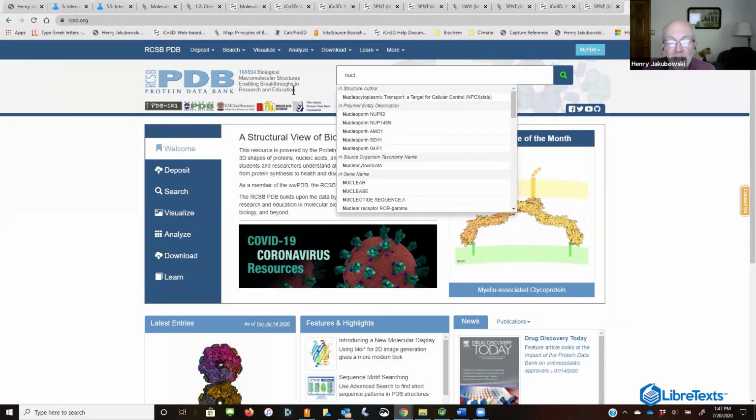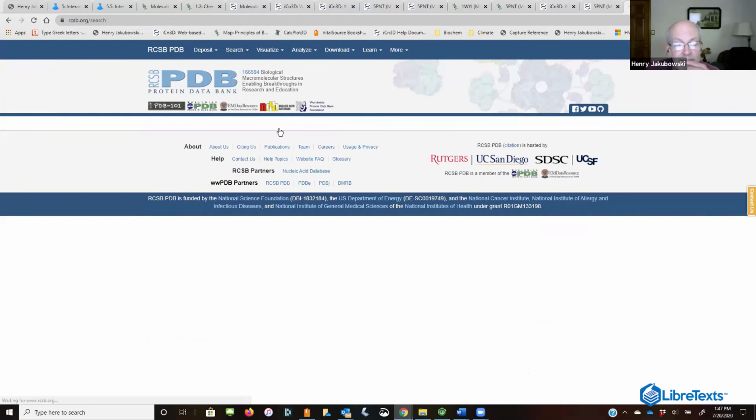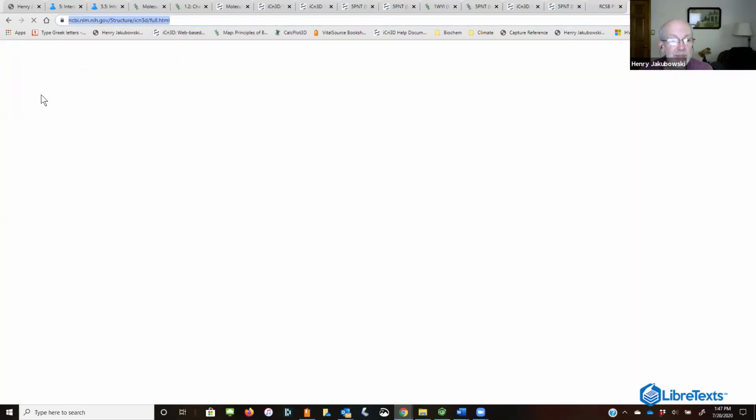So I'm going to go to nucleosome here. And let's see. Yeah, so I'll go 3LEL. So I'm just going to open up a new iCn3D and simply type in here 3LEL. That's right, isn't that right? 3LEL. Load.